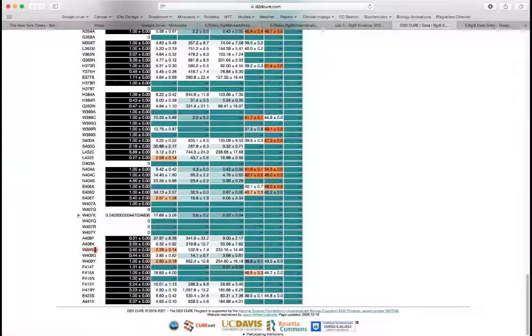which is one of the things I suggested, but I decided against. There's W409Y too, another one that I suggested, but decided against. There is no W409A, the alanine substitution. The closest thing they have is W409G. Now, we've been told not to use G, but in fact, G will work in some situations. Since the mutation that I want to analyze is not here, I'm going to settle on the next best thing, W409G.